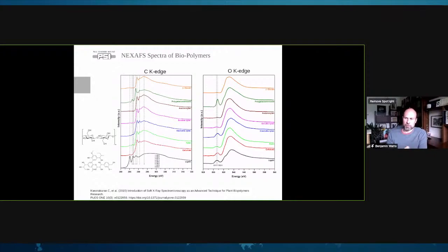Typically, for every oxygen, you're going to have a carbon atom there. So you're going to get just as much, and you can collect it at the same time as you get other kinds of information about carbon. So when we're talking about organic materials with X-rays, the carbon edge is really the place where all the interesting stuff happens, and where 99% of the research is focused.